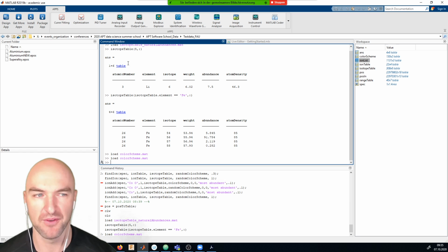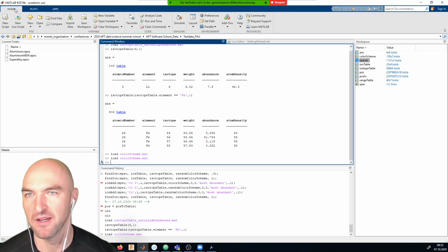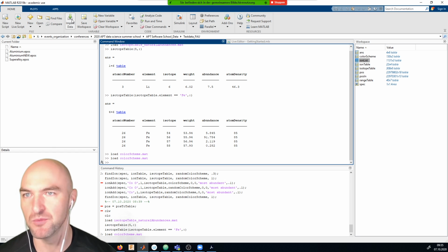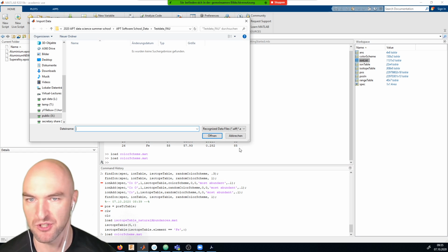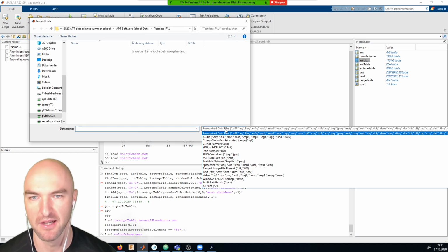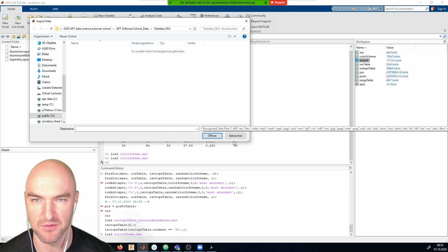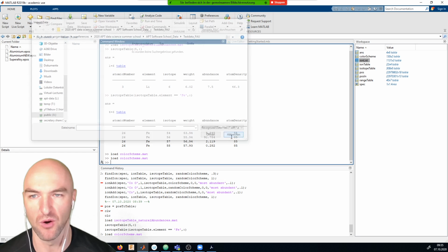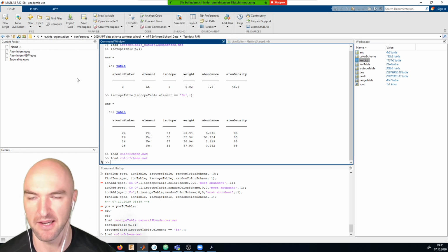If you have your own data format, for example, we have a home built Atom Probe as well, which has a different data format, then you can usually use the import data function in Matlab, which is very good to get data out of all kinds of different formats. It just auto detects what's in there to the best of its ability, and then you can very often load your data in as well. If not, we can work on file loaders.